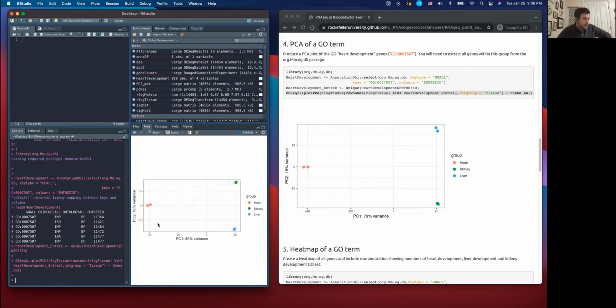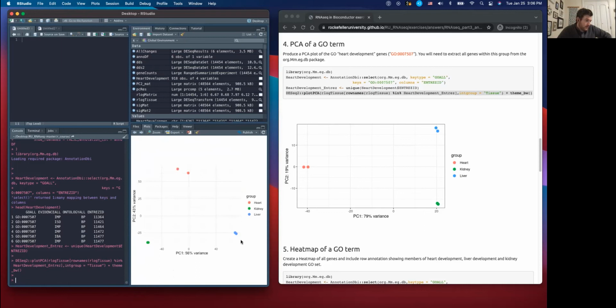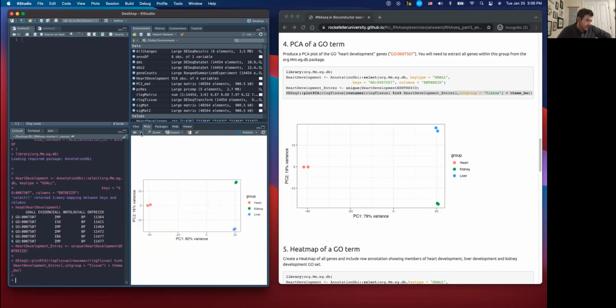This one. Right, nothing corresponds to, I guess PC2 corresponds to just heart. I'm not sure if these are labeled correctly. I think PC2 is supposed to be kidney. Okay, anyway. Yeah, it corresponds to just heart.